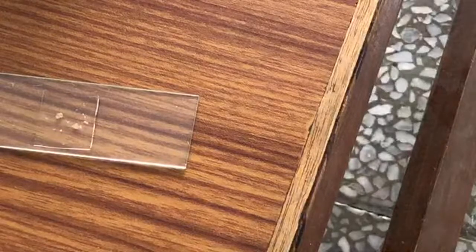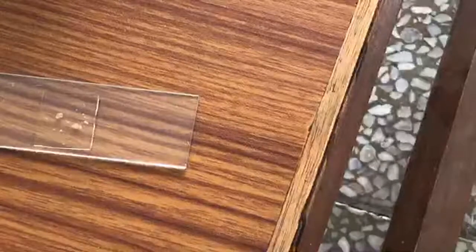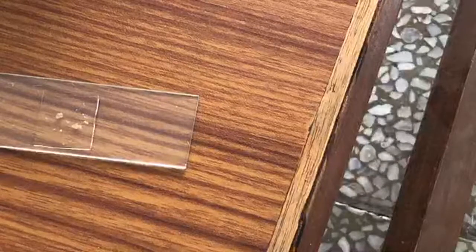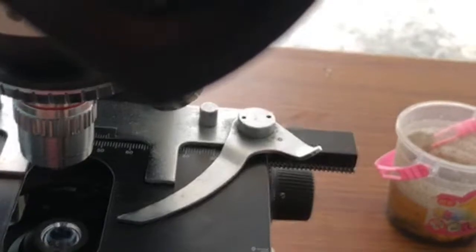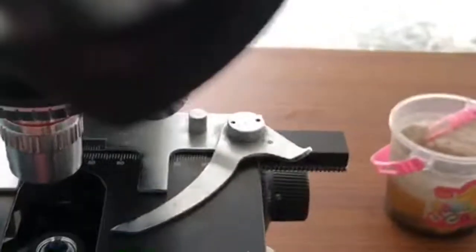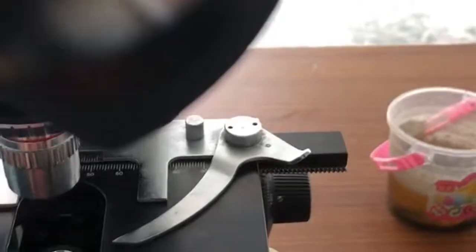So we could probably find something interesting. We are sure to find ciliates and a few rotifers, and of course, I'm very hopeful for amoeba. Now we'll arrange it here, and I will align that. The whole setup is going to be aligned with the microscope.